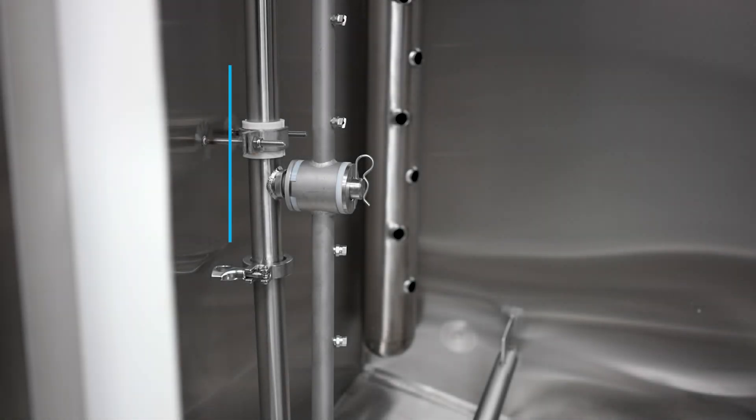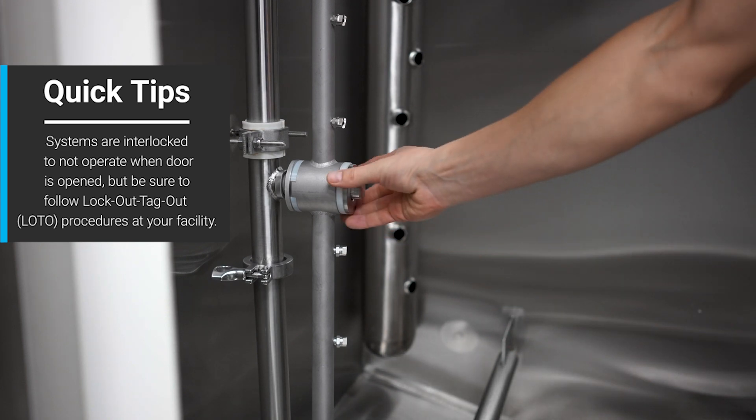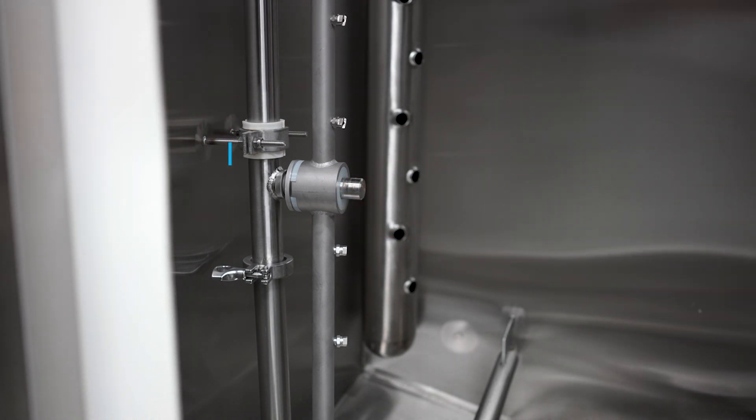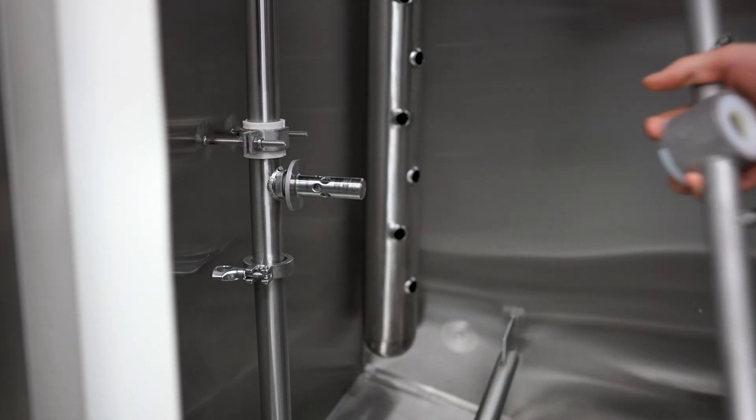To remove the rotary spray manifold, you simply go inside of the sanding cap, pull the hairpin clip, remove the two washers — one UHMW, one metal — and then remove the rotary spray manifold.